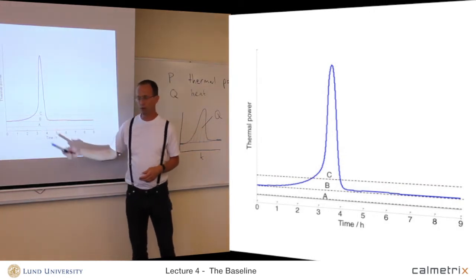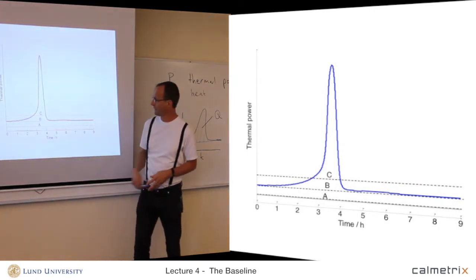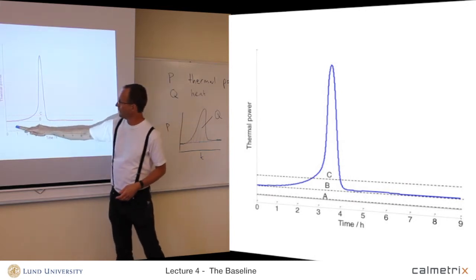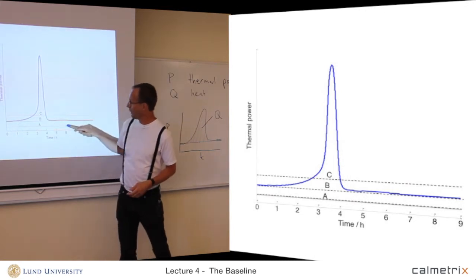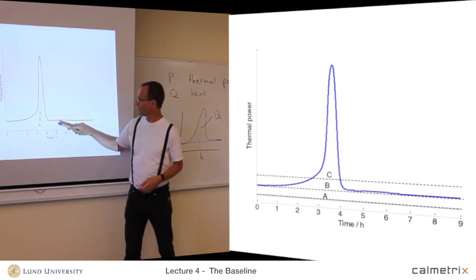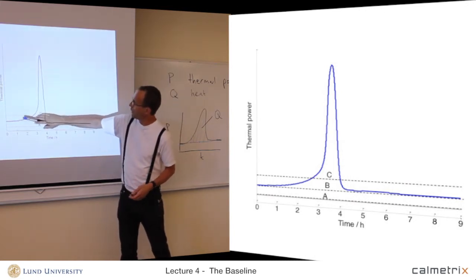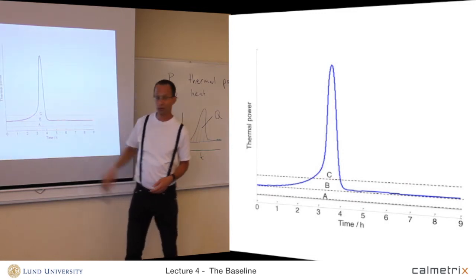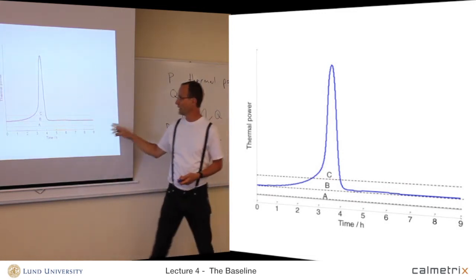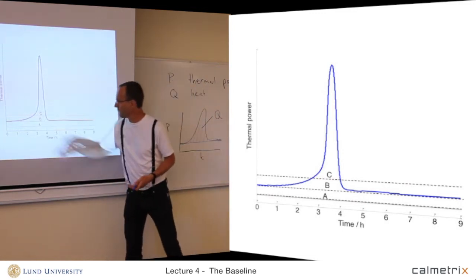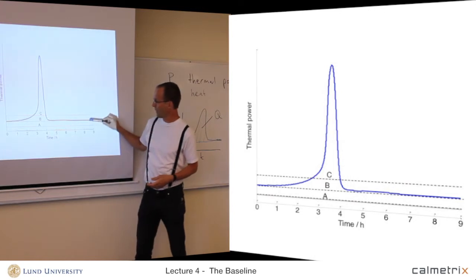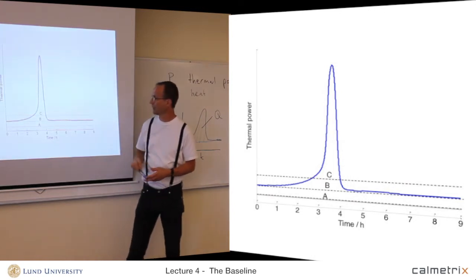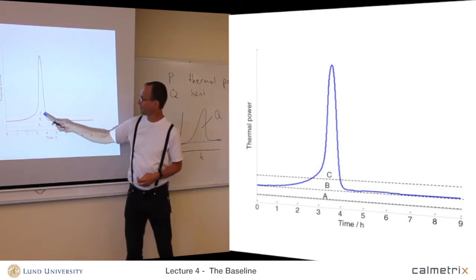Here, B is obviously the correct baseline. If I used A as the baseline and integrated, I would get far too much heat. If I used C, I would only integrate part of the peak and get too little heat. So B is clearly the correct baseline, and you must integrate above that baseline to get the true heat of the reaction.